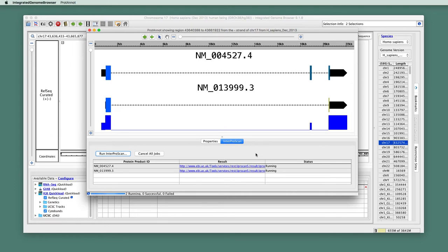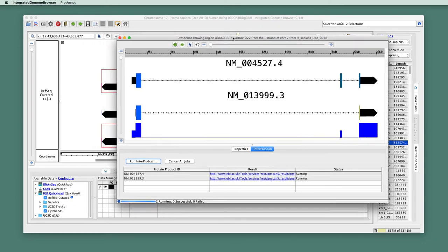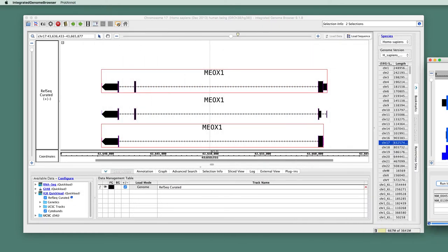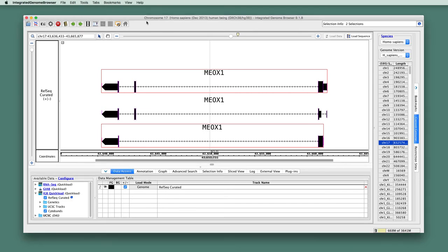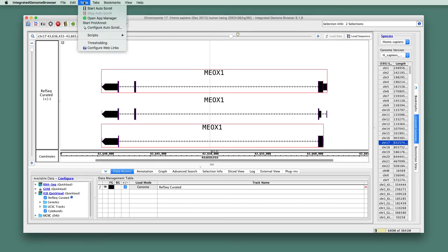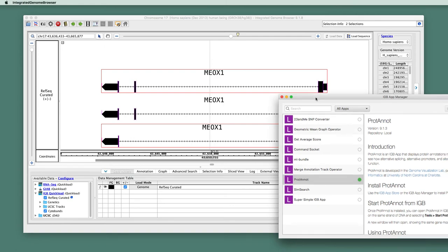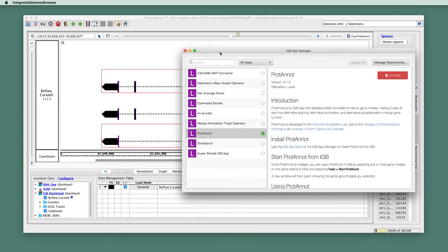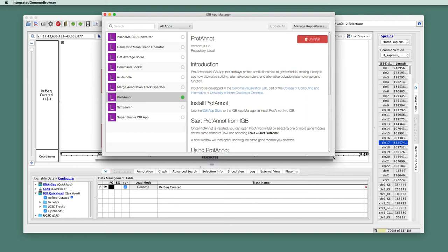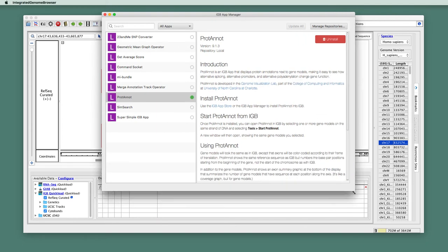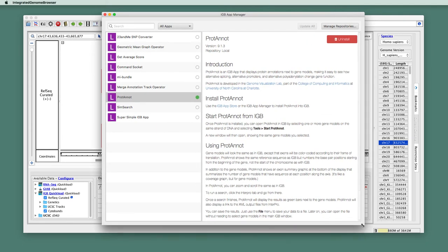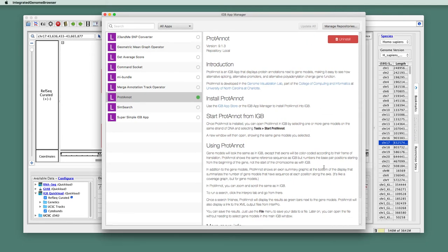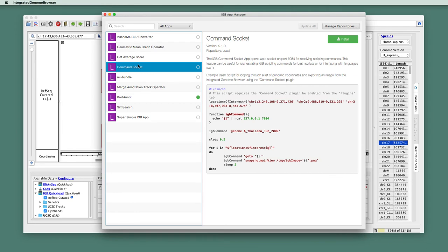Now this will take a few minutes, so while this app is going on, I'm going to show you how you can interact with App Store within IGB itself. So I'm going to move this out of the way, and we'll take a look at the Tools menu, and notice under the Tools menu there is an option called Open App Manager. So if we do this, a new window appears, and this is the IGB App Manager. This is a part of IGB itself, but it looks very similar to the App Store in the sense that it shows you different apps that you can install.